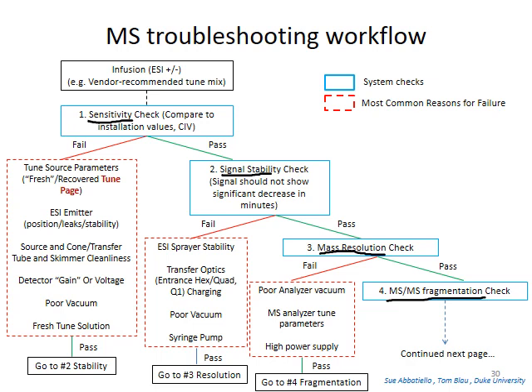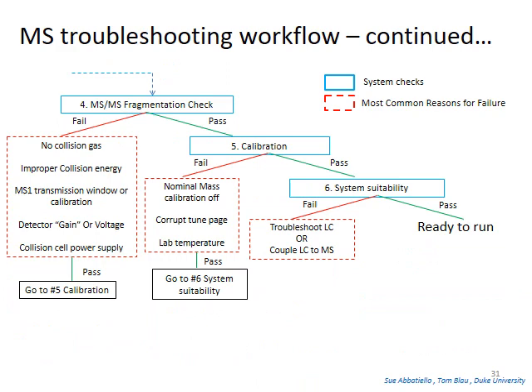You may read this slide and the next slide. The overall impression is that the vacuum is very important. So vacuum can be found as the root cause for nearly all issues. Therefore, an ideal vacuum is very important to have a working system. You may pause on this slide for better reading.